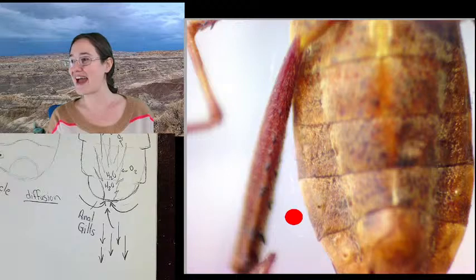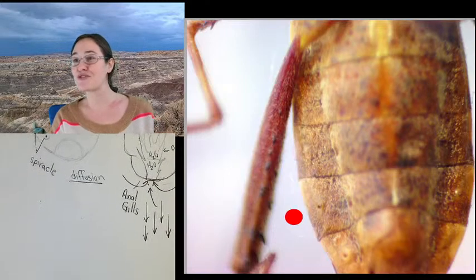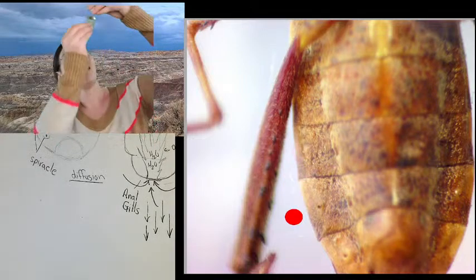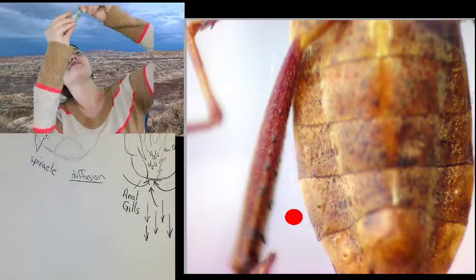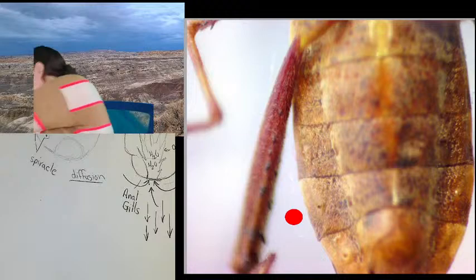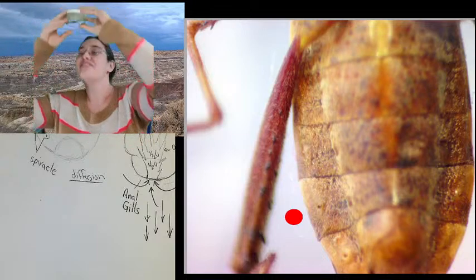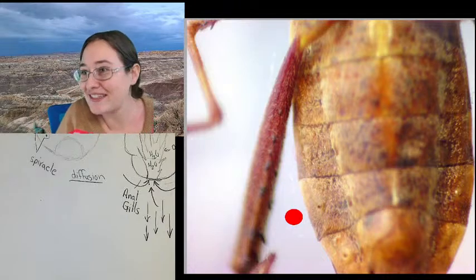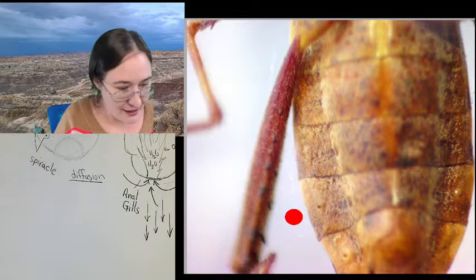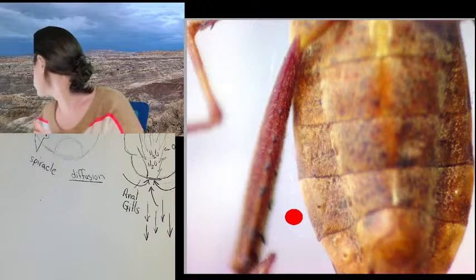Yes. And then I have a friend, KHA30S, who mentions damselflies and their feathery gills. And you know what? Do I have a damselfly in this? I have a damselfly, I swear. Really, I think I do. I do! Let's check out some damselfly gills! I need alcohol. Oh, this works.